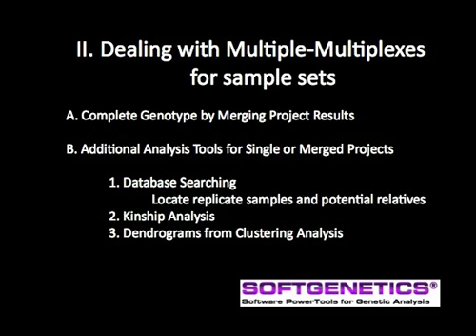We will then use this complete genotype in database searching to locate replicate samples and potential relatives, kinship analysis, and dendrogram construction. Prior to using the Merge Project tool, analyze each project, making any needed edits, and then save the project.